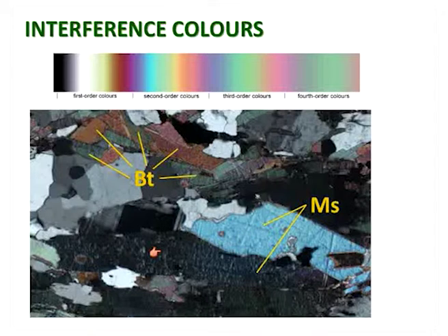Tell me what this crystal here, this is also muscovite, tell me what that is showing, what property that is showing in this particular cross-polarized view.